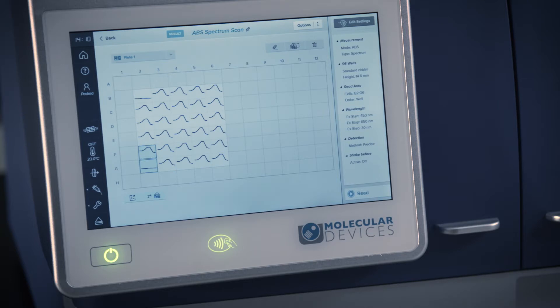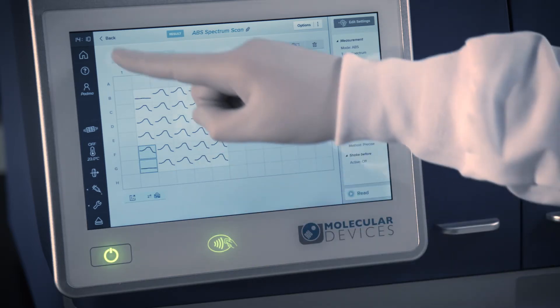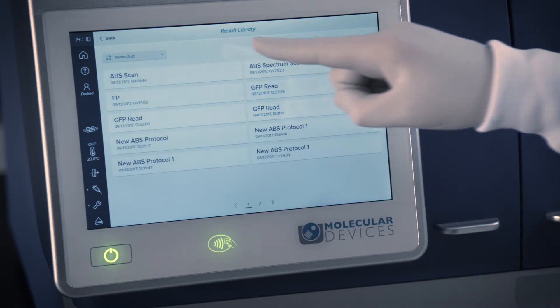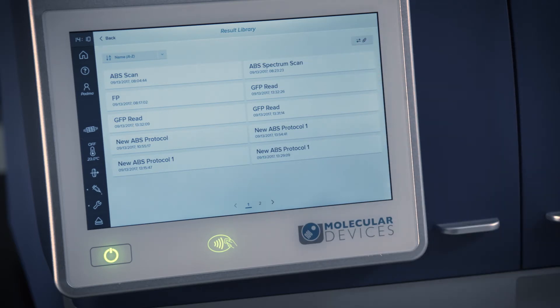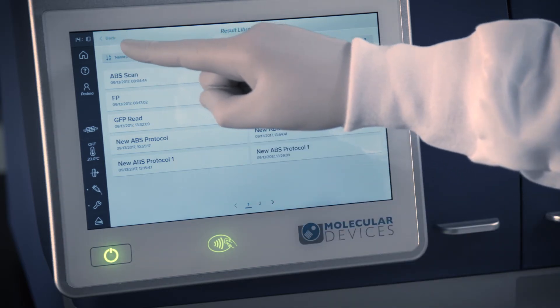After a protocol is completed, the resulting data is automatically saved as a result file with the same name as the protocol. The time and date stamped results file can be viewed at any time.